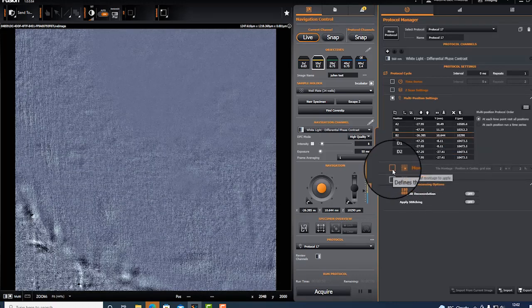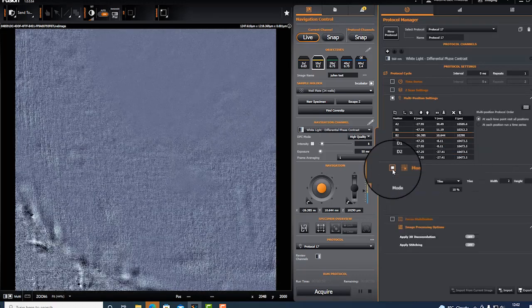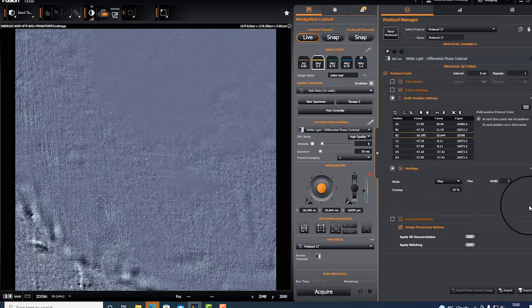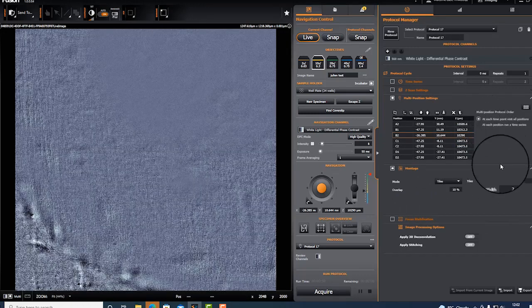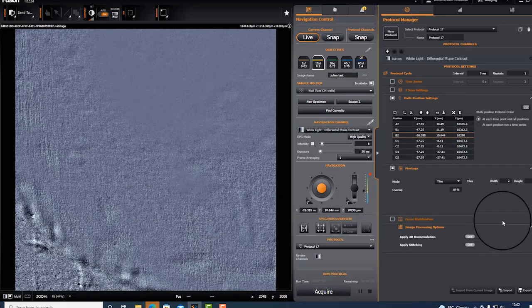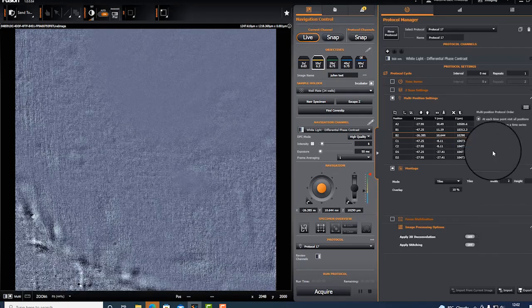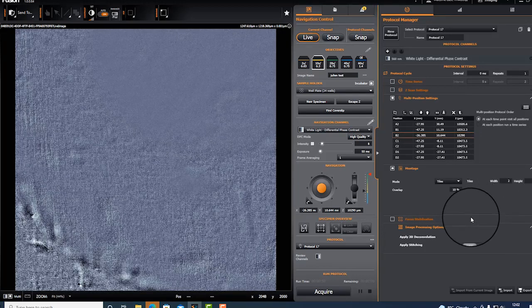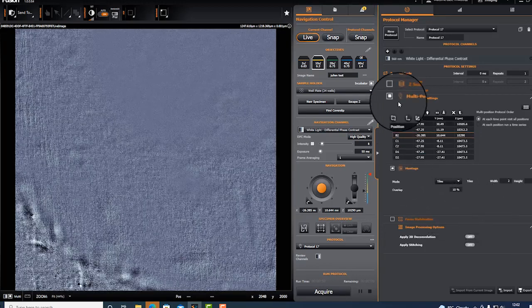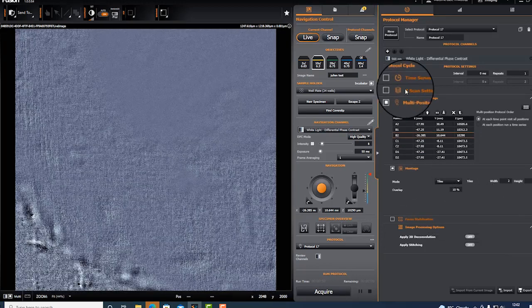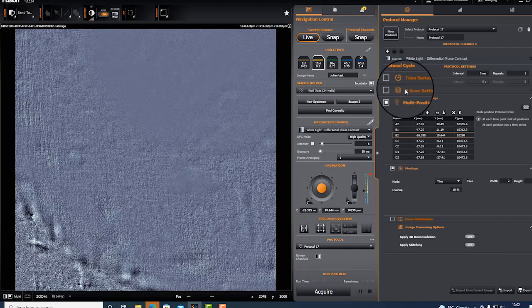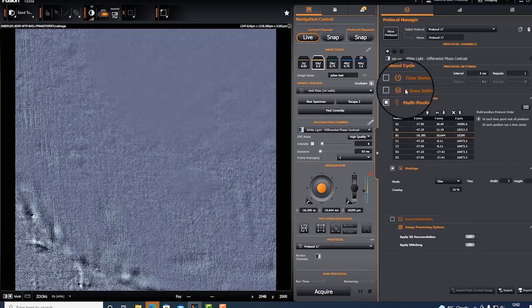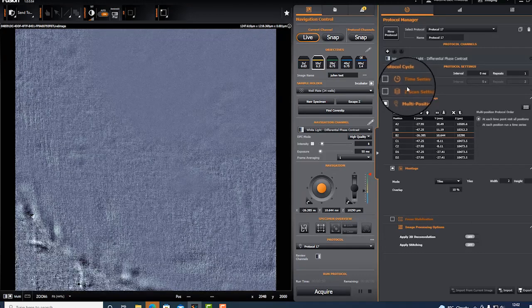You could combine and perform a montage with tiles at each well - do a two by two, a three by three position. You can combine it with z-scan. Please see how to combine z-scans with multi-positions.